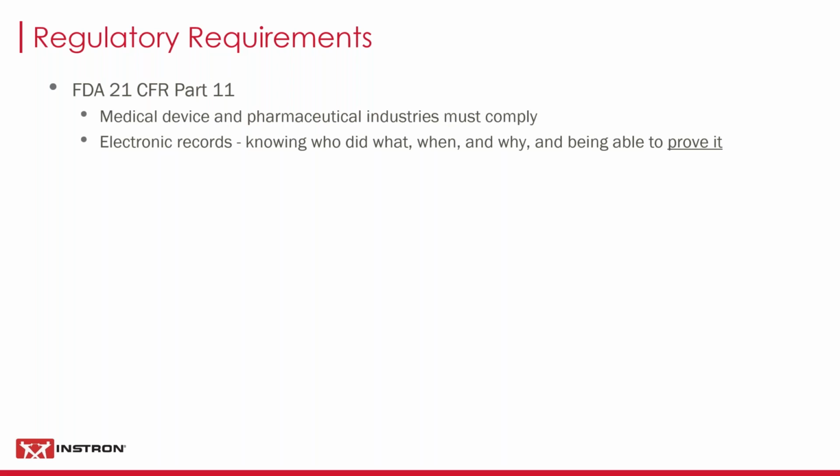While all laboratories aim to produce valid testing results, there are some major international standards and regulations that enforce traceability. So the one that I think most of the folks on the line know about is the US FDA CFR Part 11. So this is a requirement for medical device and pharmaceutical companies, and this pertains to electronic records. So really knowing who did what, when, and why, and being able to prove that in an audit.